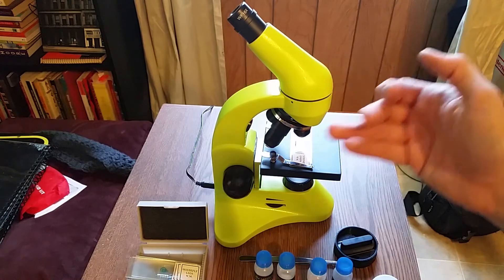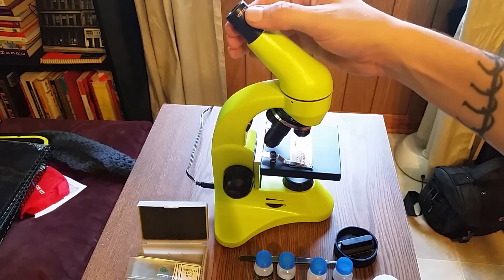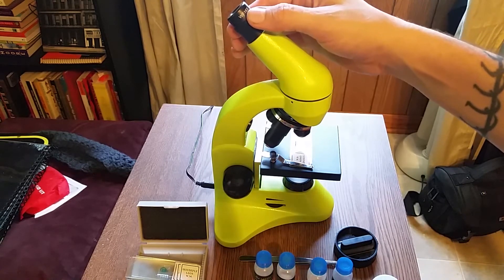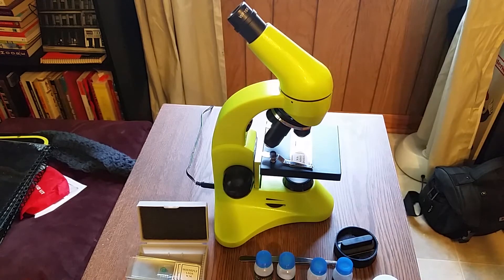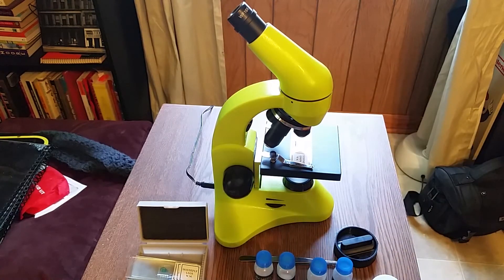The objectives are 4X, 10X, and 40X — though the 40X is listed specifically for the 50L model. The eyepiece is 16X, with 10X listed for the 50L model. You also have two Barlow lenses, a stage, a diaphragm disc, and a condenser.